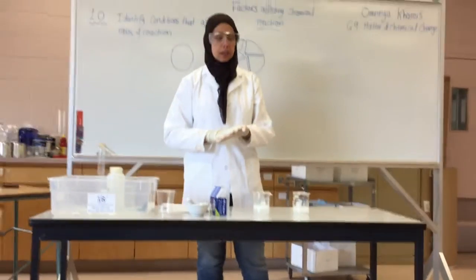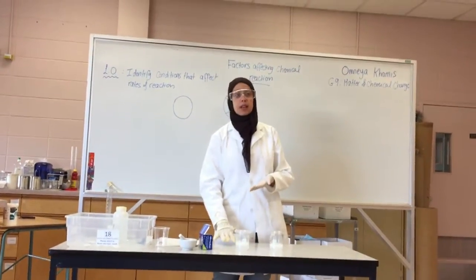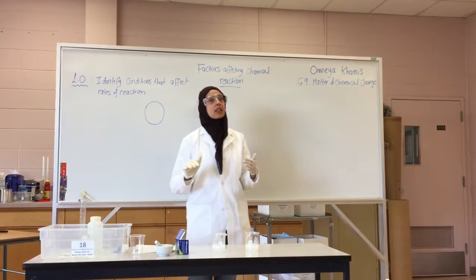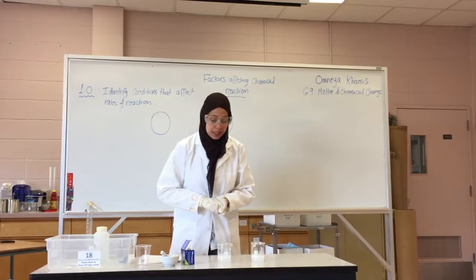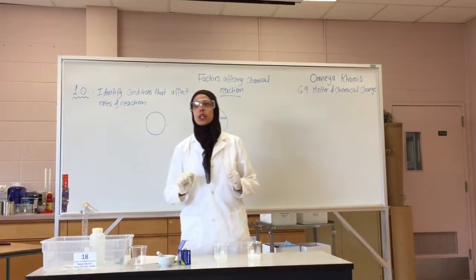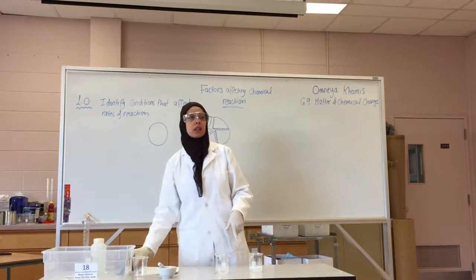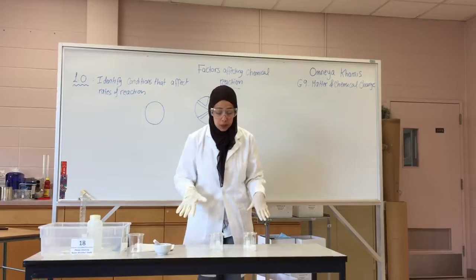So you said the crushed one will react faster with water because it has more surface area, right? So this was your hypothesis. So we need to test if this hypothesis is true or not true, so we need to observe what is happening. How do we know that the reaction reached completion from what you can see now? There's no more gas being formed? Excellent. When the gas stopped forming, it means that this reaction has reached completion.